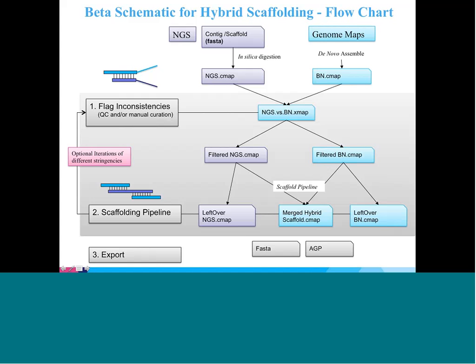The result of this ends up being a FASTA sequence, which is formed by linking together the initial FASTA files, and there's a simple tool I wrote to basically use the predicted distance from the genome map of linked contigs, and then perform a simple seed-based overlap alignment at the ends to try to merge the two FASTA contigs at that junction. And an AGP file, for those familiar who've done these scaffolds, is essentially a scaffold of your sequence contigs based on whatever your particular scaffold is.